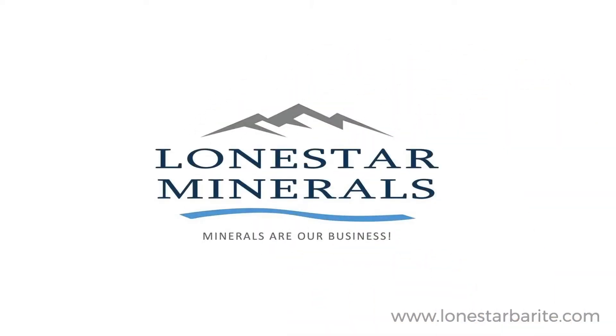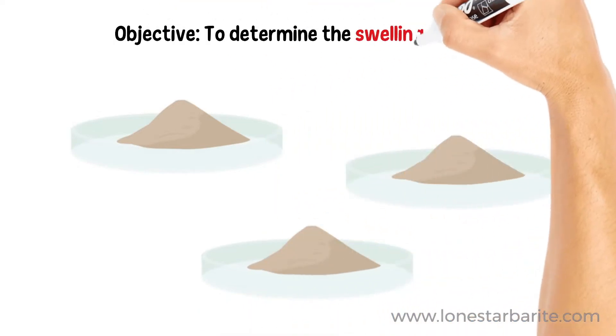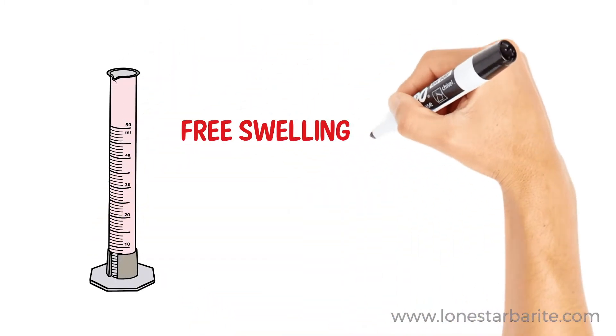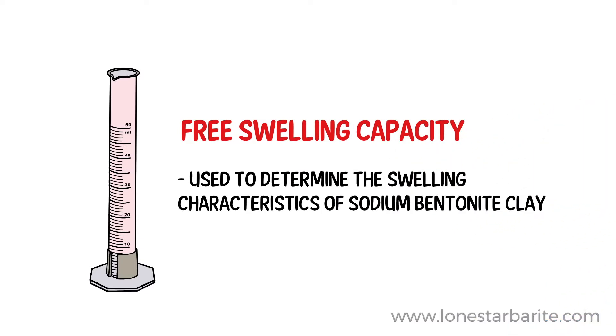Welcome to Lone Star Minerals. The objective of this tutorial is to determine the swelling index of the bentonite sample. The swelling index is often called free swelling capacity and it is used to determine the swelling characteristics of sodium bentonite clay.